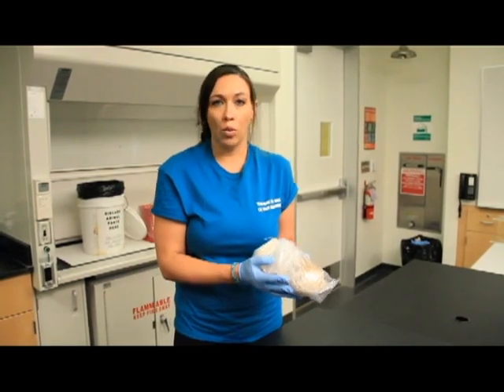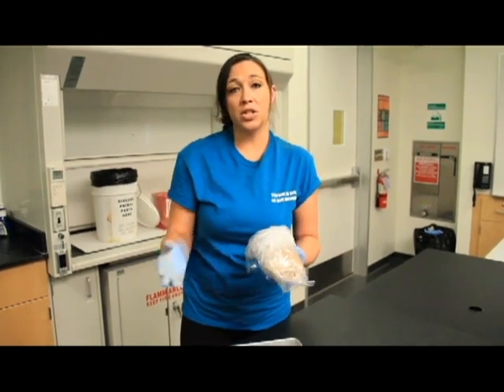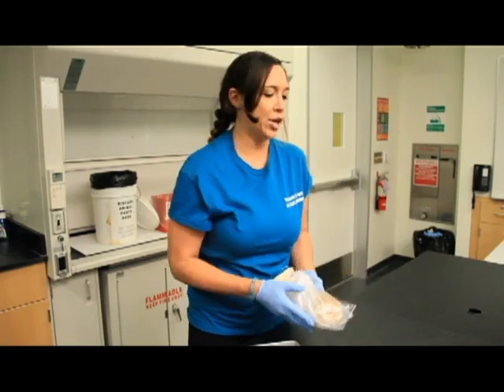This is going to go in your drawer with your TA's name on it. So it should say, in my case, Stephanie, Tuesday at 11. So you would find the drawer that says Stephanie Tuesday at 11 and place your pig in that drawer.